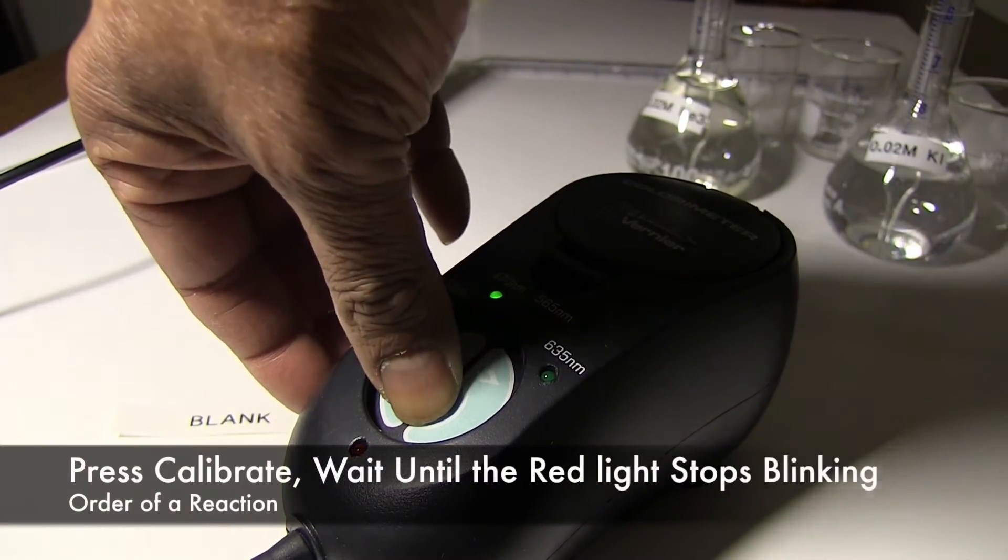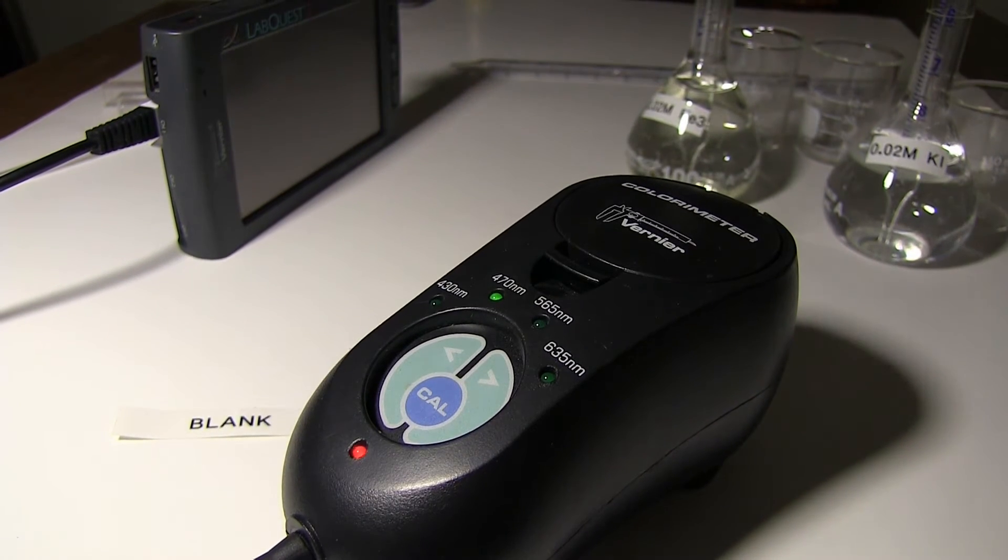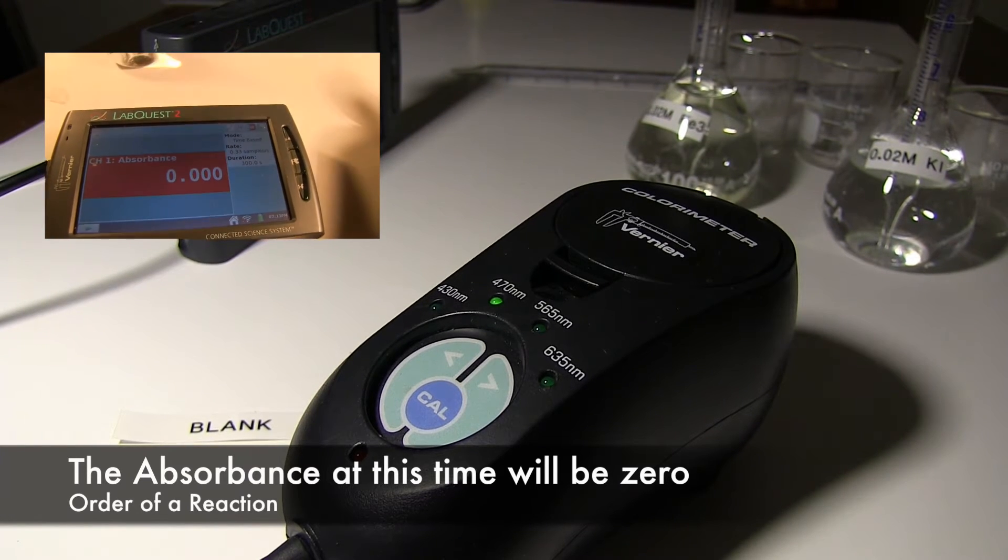Close the colorimeter, press calibrate, wait until the red light stops blinking. Now the colorimeter is calibrated and you can perform your experiment. After calibration, the reading on the LabQuest for absorbance will be 0.